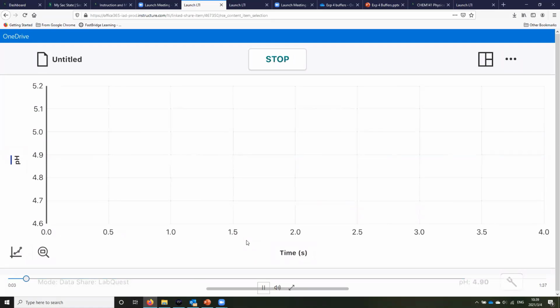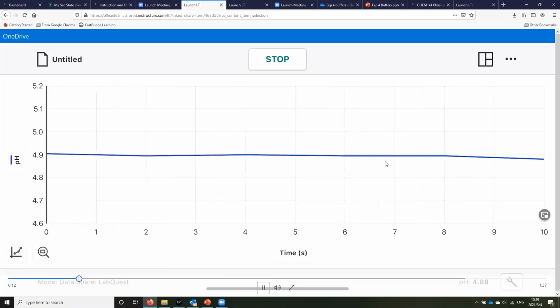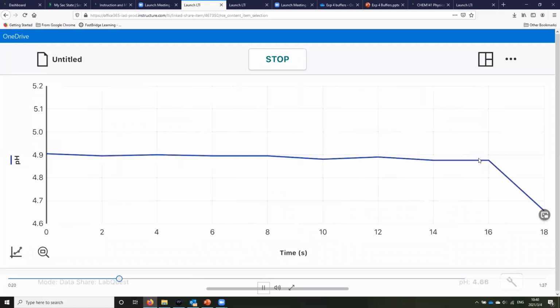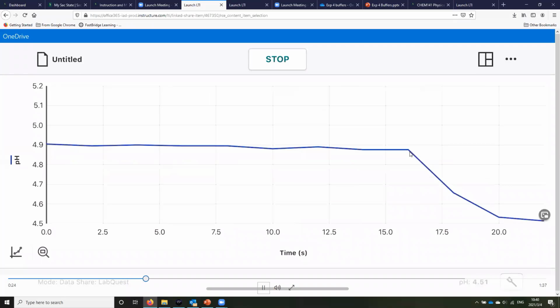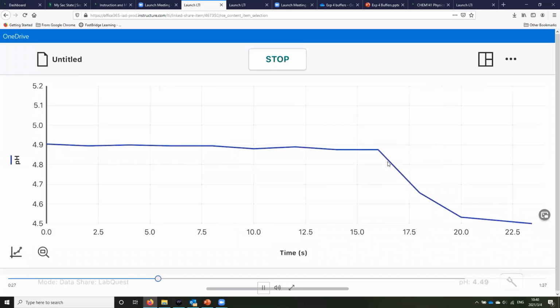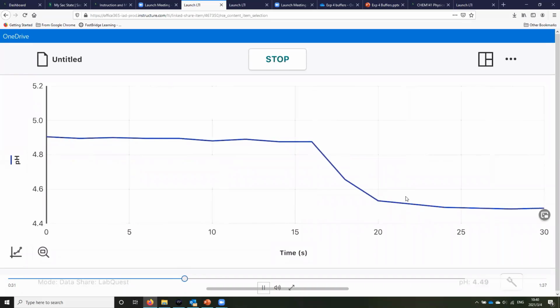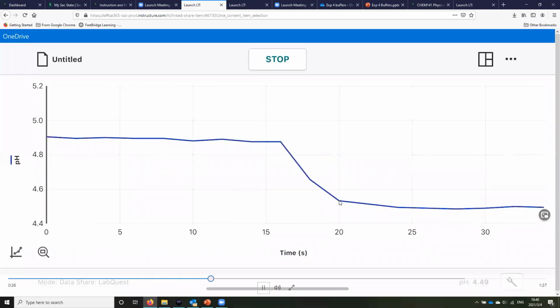The pH meter can record the pH value over time, with time on the horizontal axis. So we'll see that it is stable before I add any HCl. It has some fluctuations because the instrument reading always has some noise. And at that point, we began to add HCl. You can see the pH drop a little bit. That's not because of the measurement or electronic noise, that's because of the HCl addition.